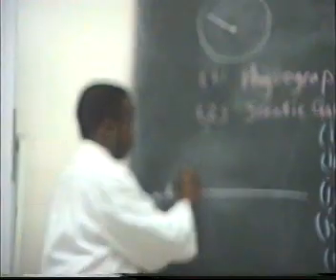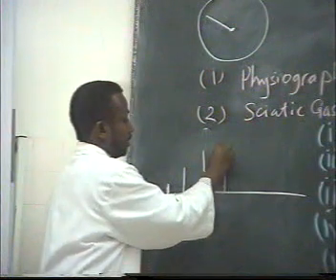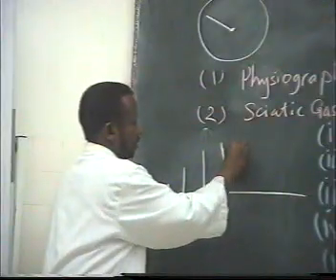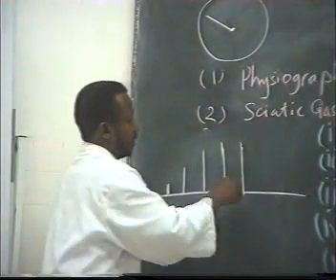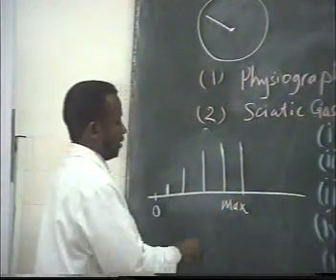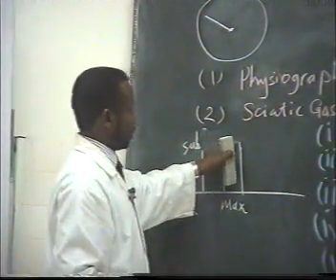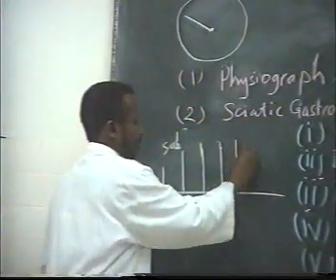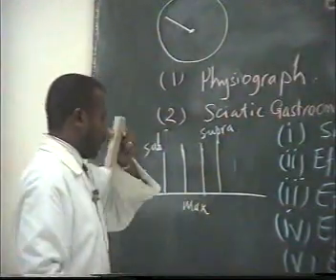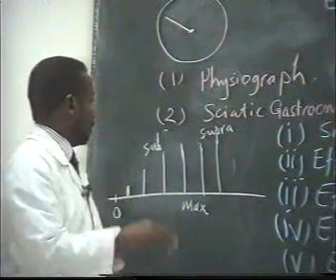As we increase the strength of the stimulation, the response will increase gradually until we reach a point where the response will not increase. This point is considered the maximal stimulus, and the ones before it are sub-maximal. After that, when the response is not changing, all these stimuli are considered supra-maximal.